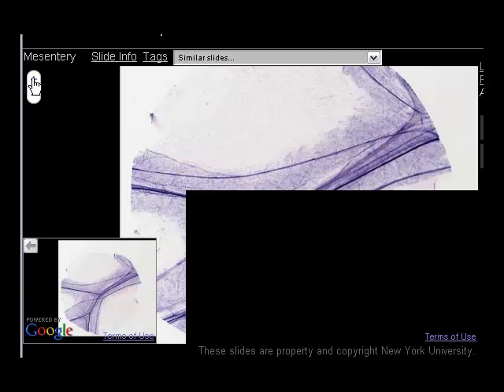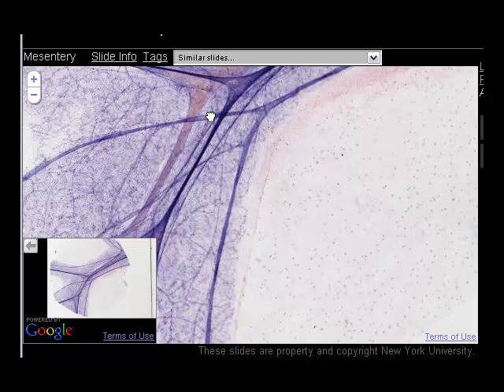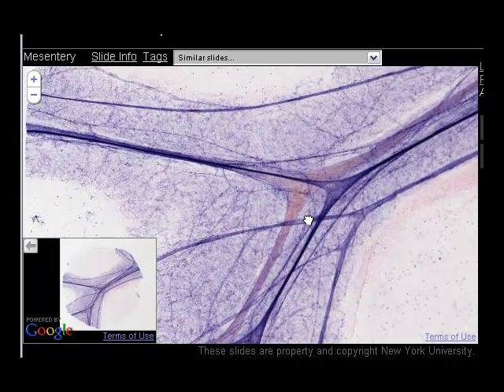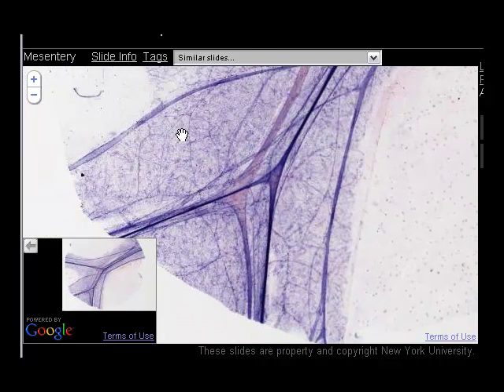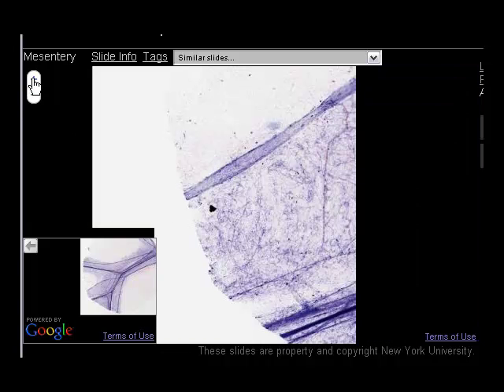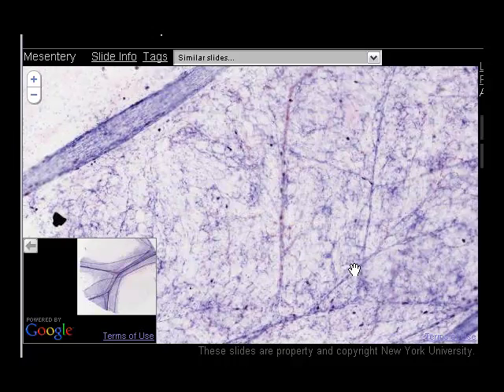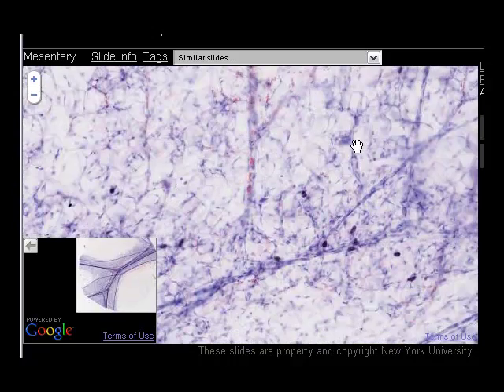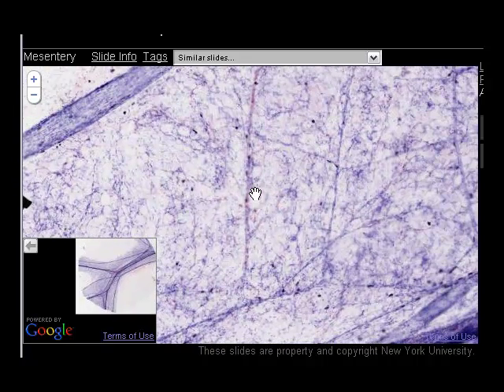As we increase in magnification, there are various parts to this slide in which you'll see slightly different appearances to the mesentery. So here we have a large number of folds in the tissue where it's been squashed up, but also a fairly large number of blood vessels. And if we were to zoom in on the appearance here, you'll see very nicely the meshwork of blood vessels here as an example that extend and ramify throughout the tissue.